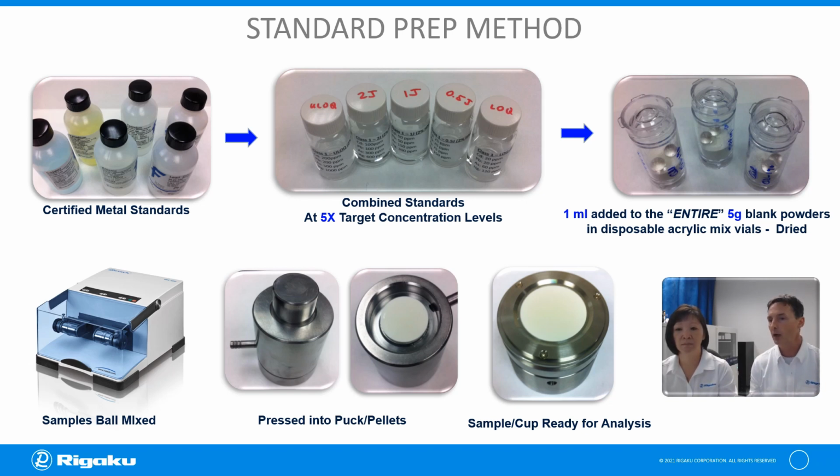We still go and run our ICH-Q3D methods that we've created and still get results within spec 5 years later without having to do any kind of calibration. So that's a really major point to make. That's key, and it's not like chromatography or LC-MS where you're doing the calibration every day before you run the unknowns. This you do once, and then the method is saved on the system. From there, you would just go and make your unknowns and check it. Right. You might have a system suitability material or something that you're just doing a check to verify you're still within spec.